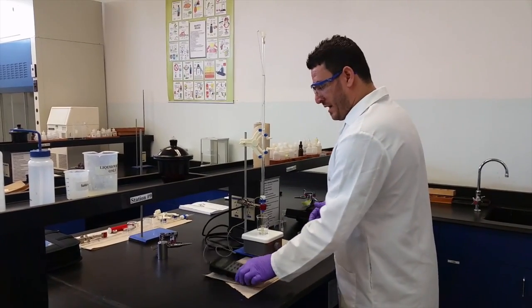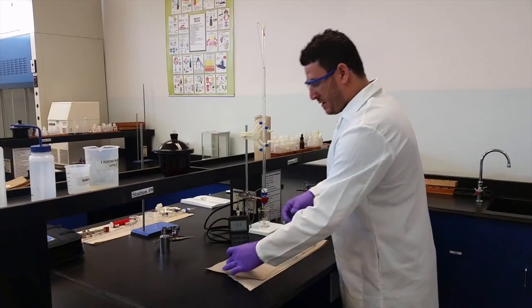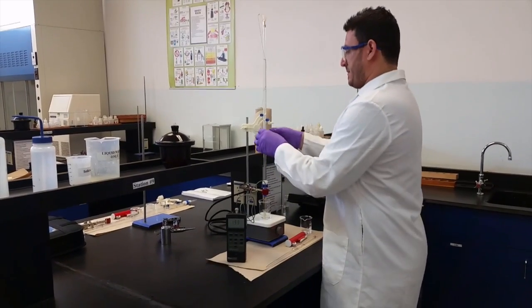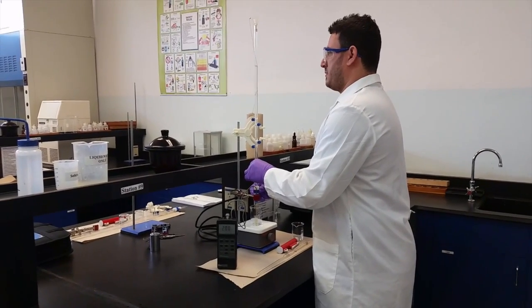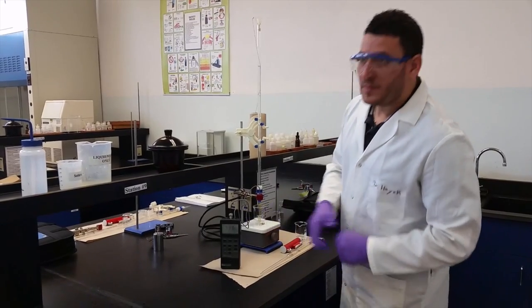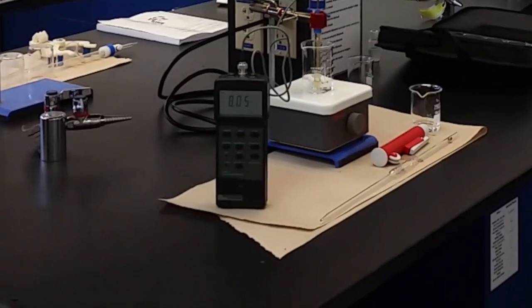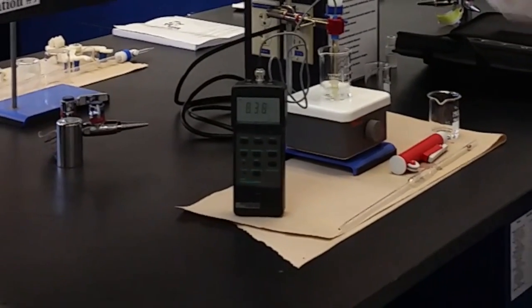Okay? And you can see that now it's increasing. Now if I leave it like that, what is the pH now? 8. So it's going to stabilize. So you see the jump?